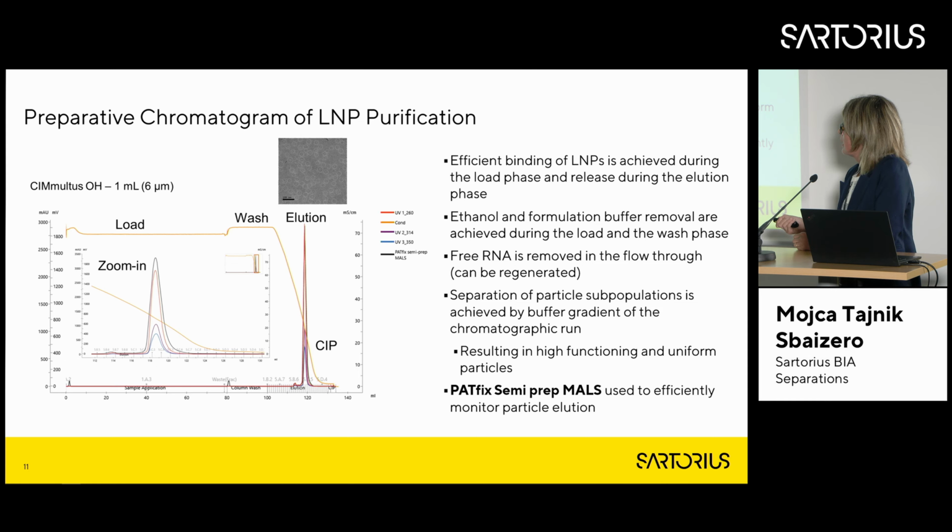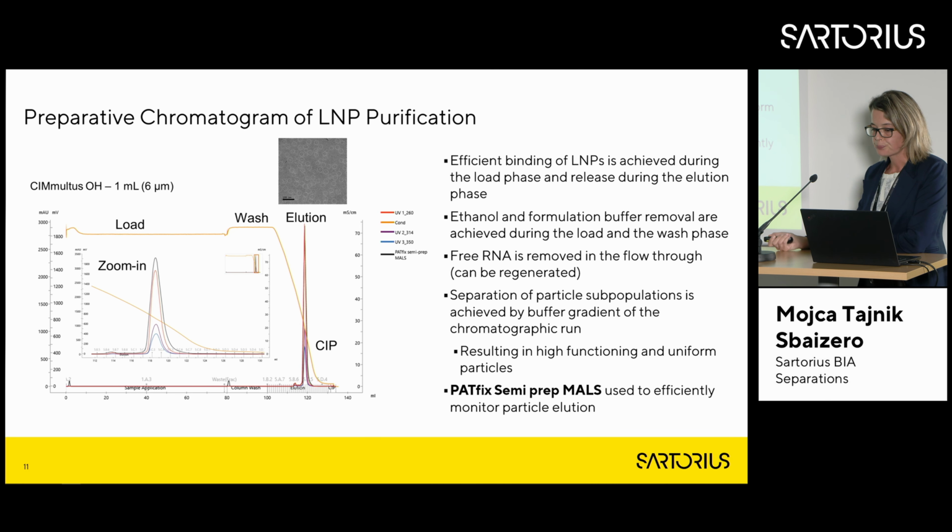You add sample, you wash, then you elute, you get the high peak, and then here you have cleaning in place, with no peak or a very small one.